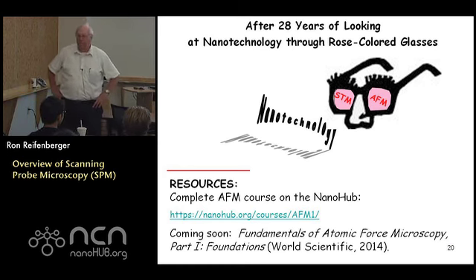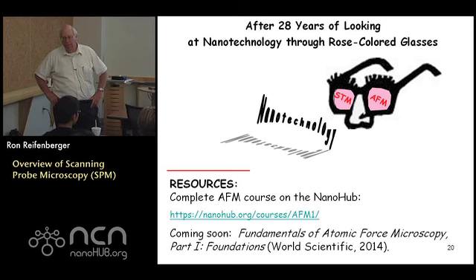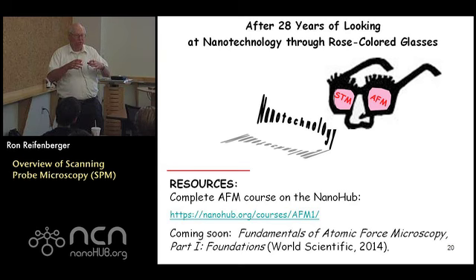You say that you use the voltage to move the tip. Isn't there a possibility that that voltage could interfere with the force between the tip and the substrate? Yeah, there's a question about we use the voltage to move the tip, and could it be that that voltage could interfere with the forces? And that's certainly true. If you put that voltage right on the tip, and if your sample was grounded, then there would be a capacitance between your tip. Well, there's always a capacitance between the tip and ground. You put a voltage, then there's going to be a force, and the tip is going to bend due to the voltage that you apply.